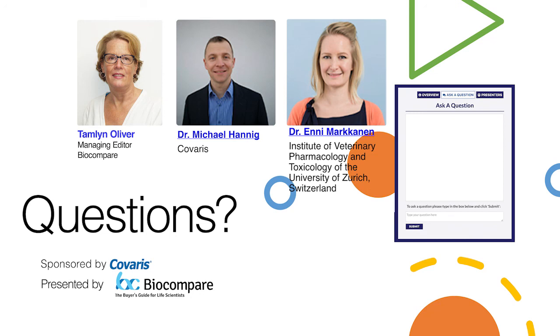But the point is that we do not need overnight digestions, because we can actively remove the paraffin and then decrease the time for the proteinase K digestion and the decross-linking. So overall, we can do that in some hours. And then, of course, it depends on the number of samples and whether you do everything in an automatic way or manually. But within some hours, you can extract both.